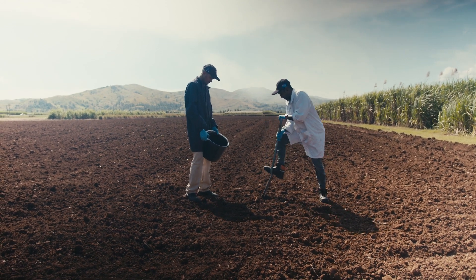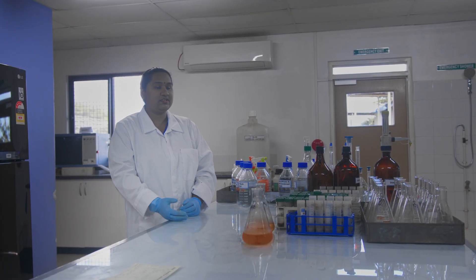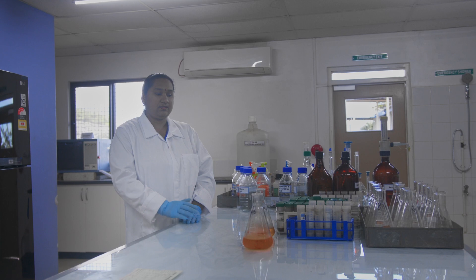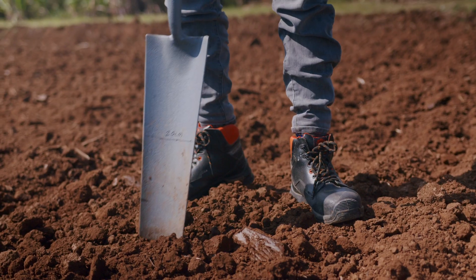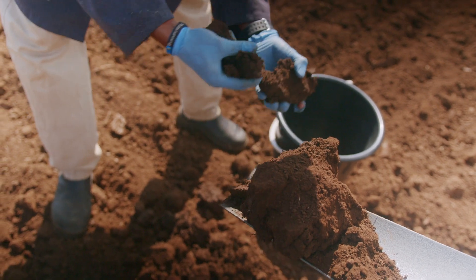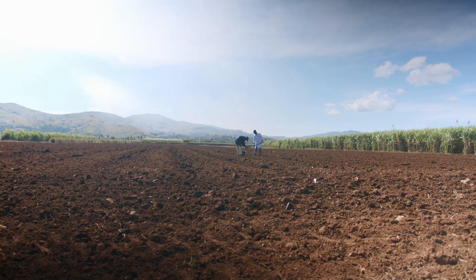We also carry out soil sampling in the field. This is a very critical part of our research because it will further determine the soil results or recommendations we generate specifically for farms. The sampling will help determine the soil health and nutrient status. We follow a zigzag pattern, taking core samples which are thoroughly mixed to produce a composite sample that represents the entire field.